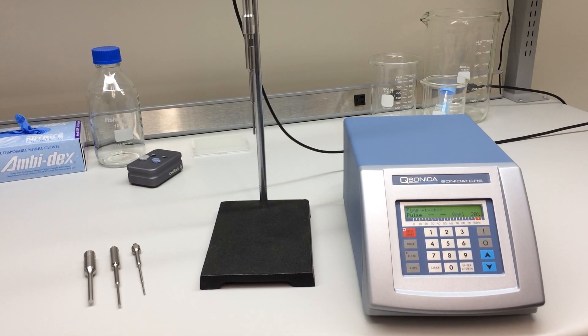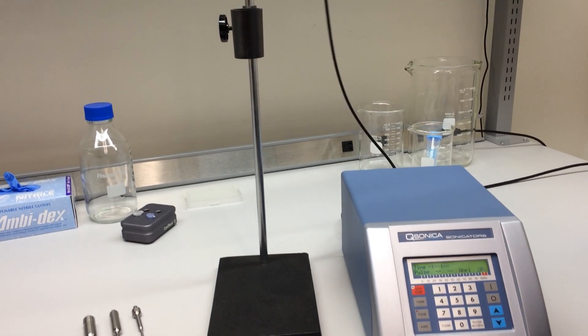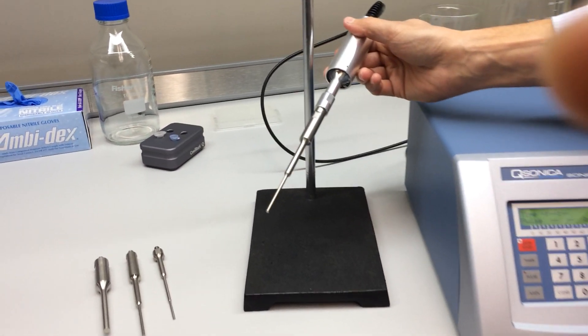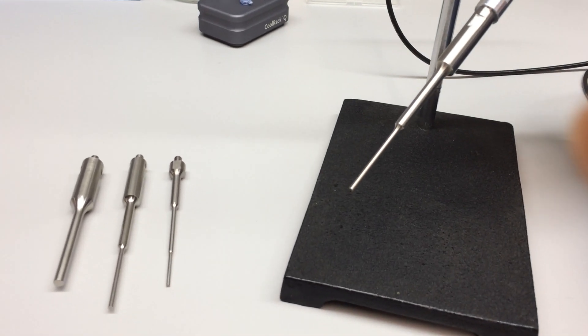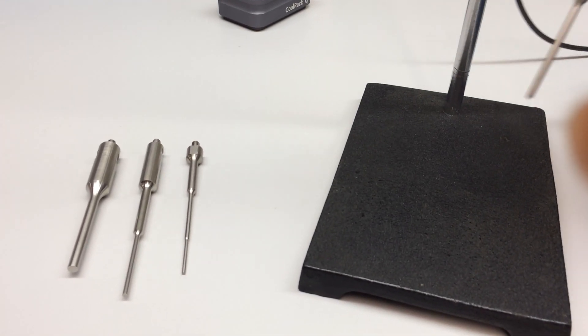This probe is used for 0.5 to 15 ml samples. There is a 1/16 inch probe for 0.2 to 5 ml samples, or a ¼ inch probe for 10 to 50 ml samples.